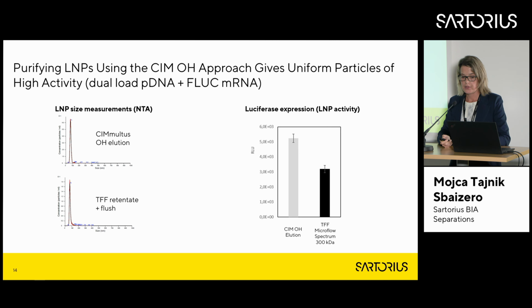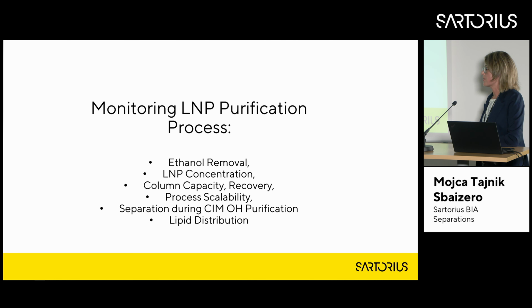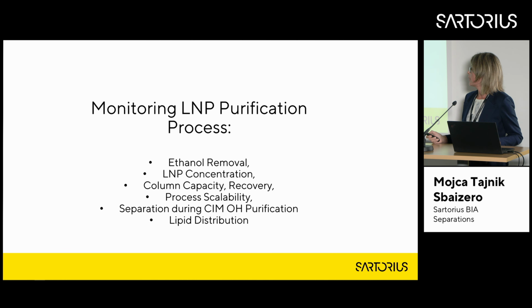So these were the three cases, where we showed activity comparison and size. Now I will move to monitoring the process during process development: what attributes you can follow during process development and also later for manufacturing. We will mention ethanol removal, concentrating of LNPs, and how much you can load on the column.